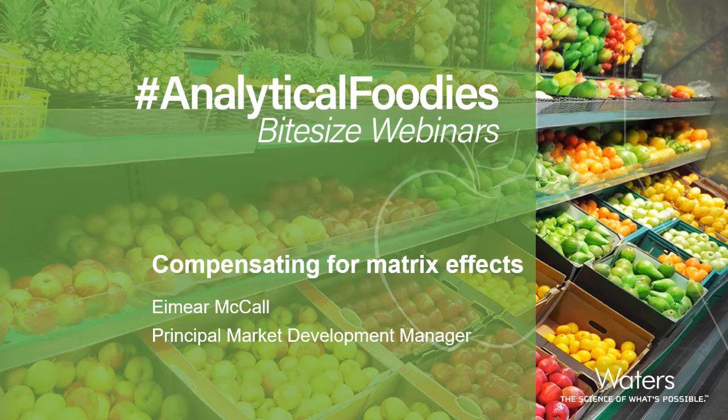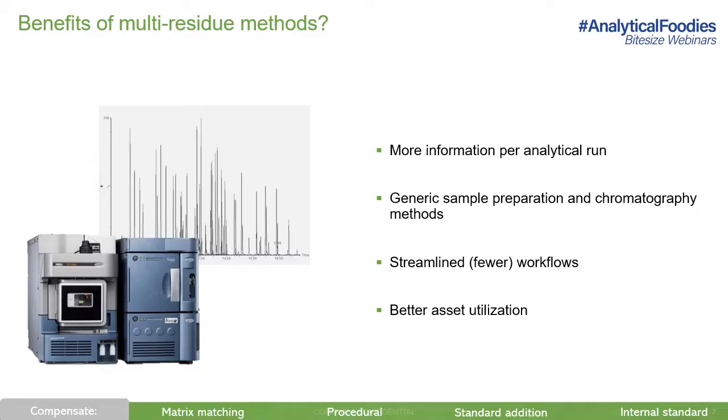The topic of this episode will look at a number of methods to compensate for matrix effects during method development. In previous episodes, we've touched on the benefits multi-residue methods can offer labs in terms of productivity. Of course, in running these methods on mass spectrometry, matrix effects are a common occurrence.